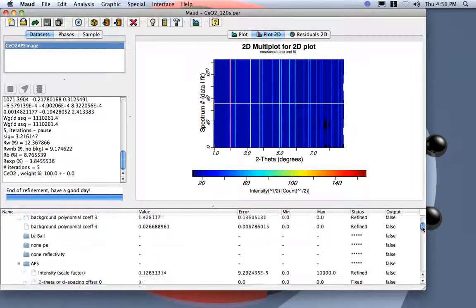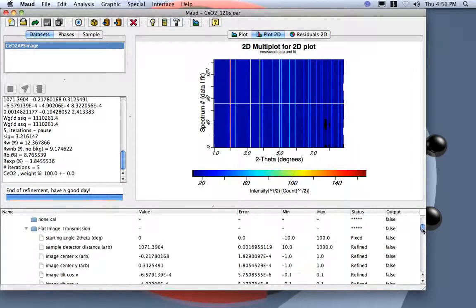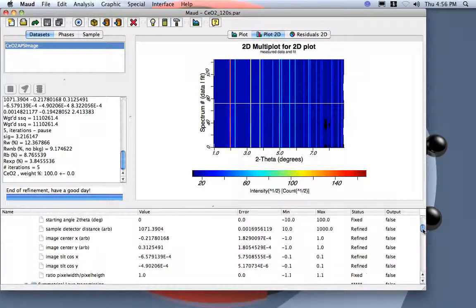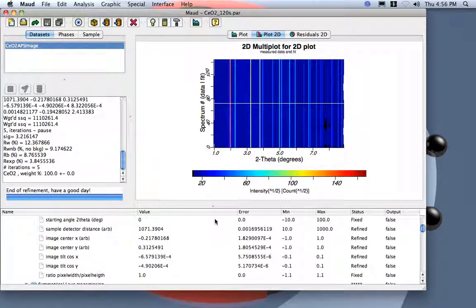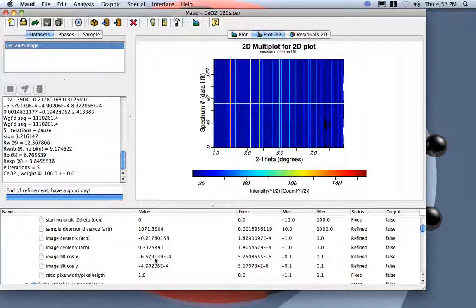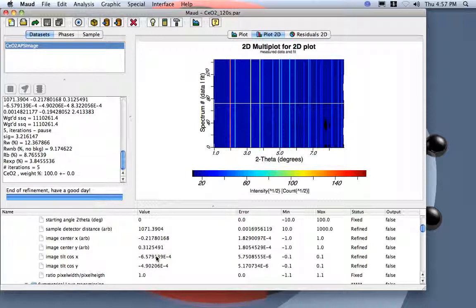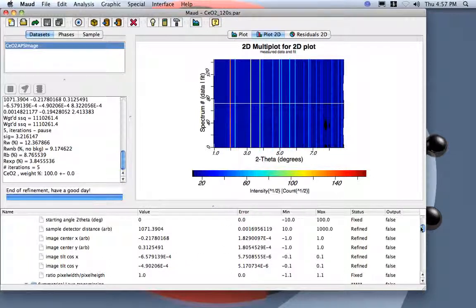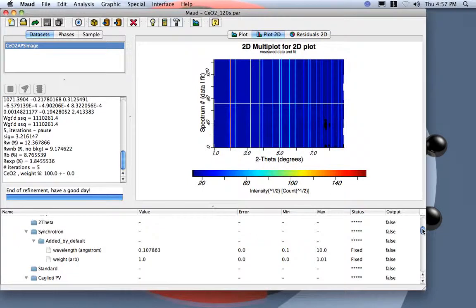Looking down here, you see the B factor. Here I find the sample detector distance to 1071.4, and the center X and Y. We were quite far from the value we imposed. And then, the image tilt is just a little. So the detector was put very well. The tilting is mean, but in any case we need to refine it.